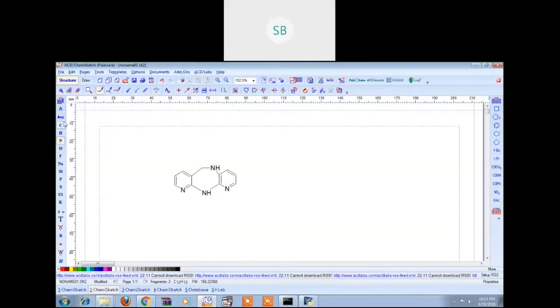This can be bridged up, and beneath this we have to put one cyclopropyl, right? So likewise, I'm just putting a cyclopropyl here, and we have another carbonyl group here. On top of it, we have a methyl, right? We can change it to methyl. So this is the raw structure of nevirapine, right?